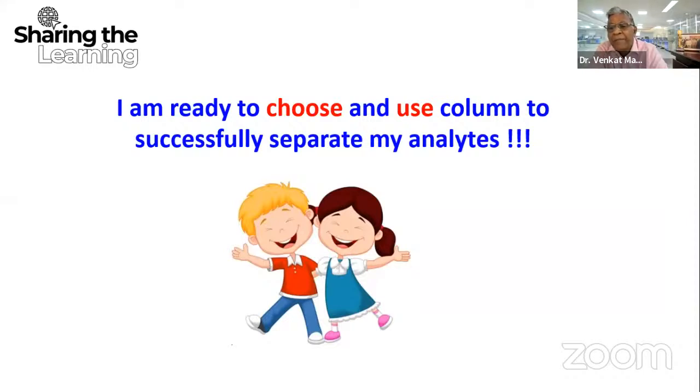Okay. Yeah, the questions are pouring in again. Should we adjust the pH of the mobile phase so as to keep our compound fully unionized or fully ionized? This is a question from Mr. Prashant. It depends upon the separation that you are looking for. What kind of separation are you looking for? Because this question is a little bit abstract to answer fully.